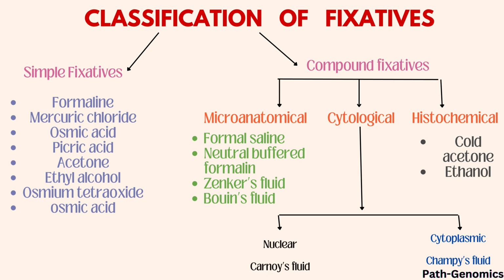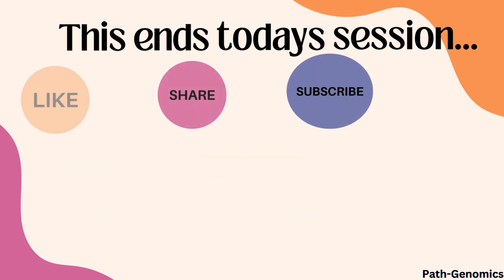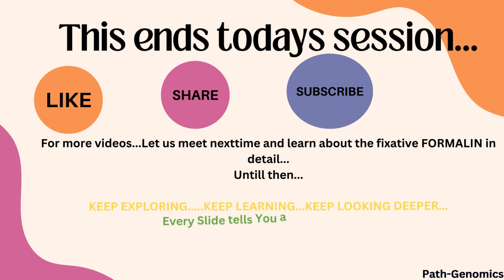They are further classified into microanatomical, cytological, and histochemical fixatives. Microanatomical fixatives are formal saline, neutral buffered formalin, Zenker's fluid, Bouin's fluid. Cytological fixatives are further classified into nuclear and cytoplasmic fixatives. Nuclear fixative is Carnoy's fluid. Cytoplasmic is Champy's fluid. Histochemical fixatives are cold acetone and ethanol. Here ends the session on basics about fixation.